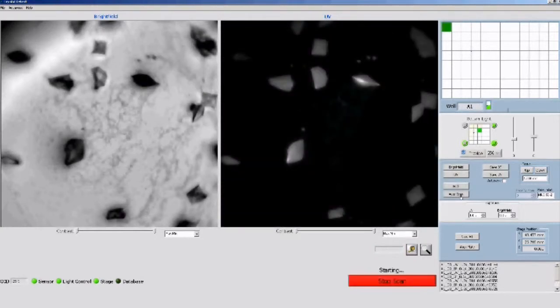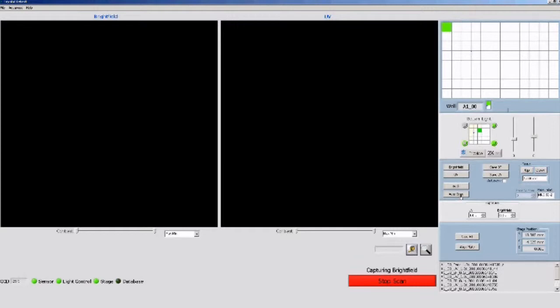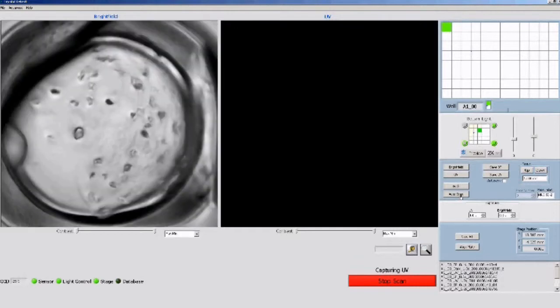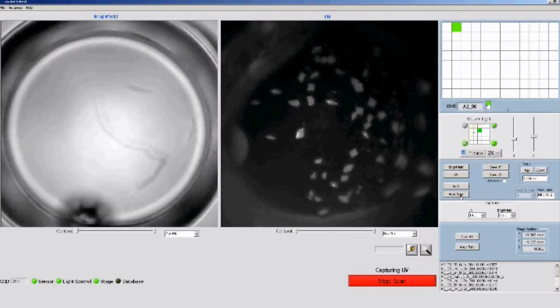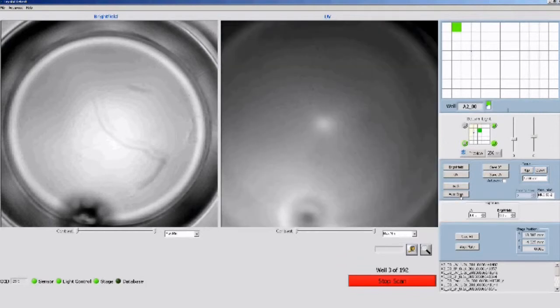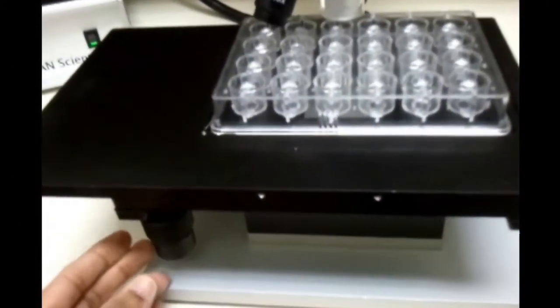In the plate scan mode, the images are presented side by side as the scanning occurs, and they are also saved automatically into a database if that option is chosen. The scanning can be stopped at any time by clicking on the red bar. There is a progress window on the right side as well.